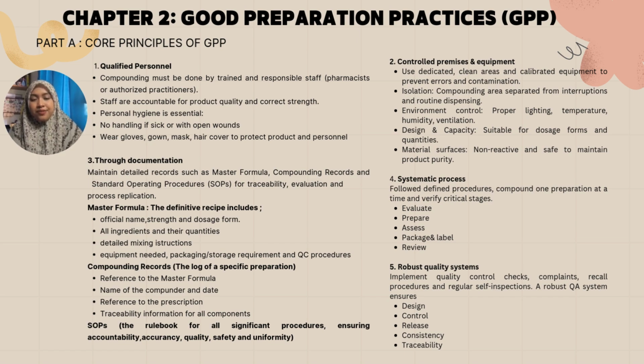Besides, good personal hygiene is very important, and anyone who is sick or has open wounds should not be involved in compounding. Staff must also wear appropriate protective clothing, such as gloves, masks, and hair cover to protect both themselves and the product from contamination.